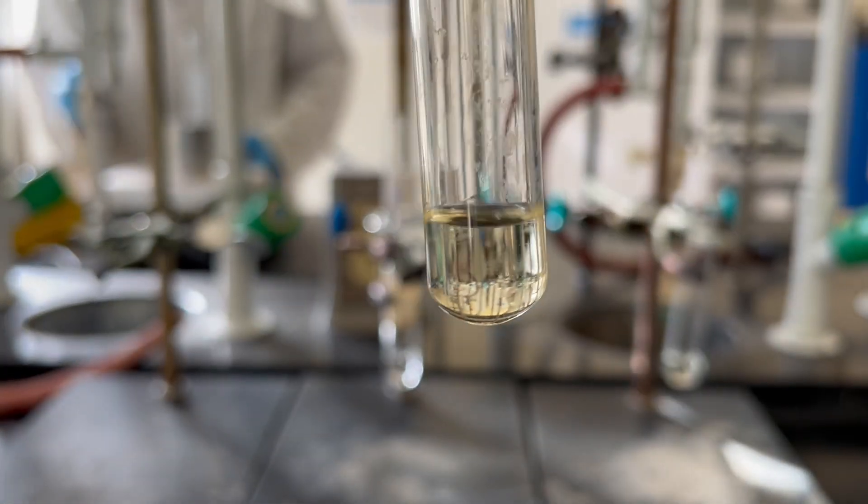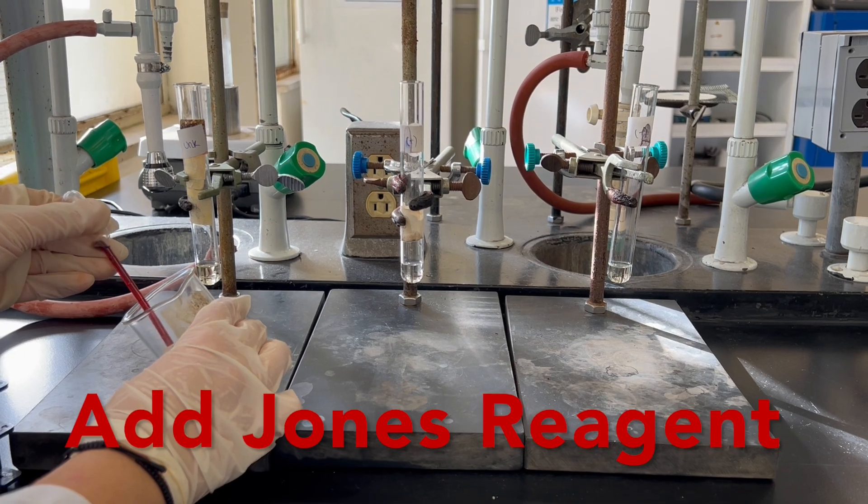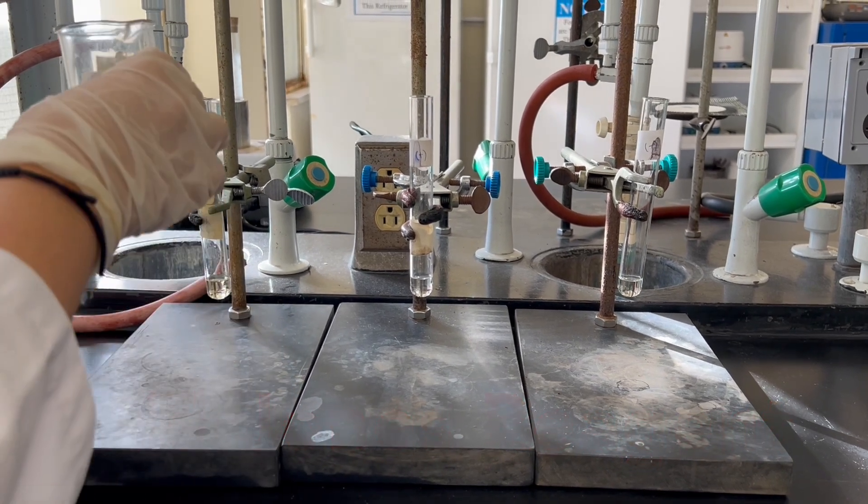We will shake well and make sure that it is well dissolved. Finally, we will do the last step, which is adding the Jones reagent and observing the change of color within two seconds.